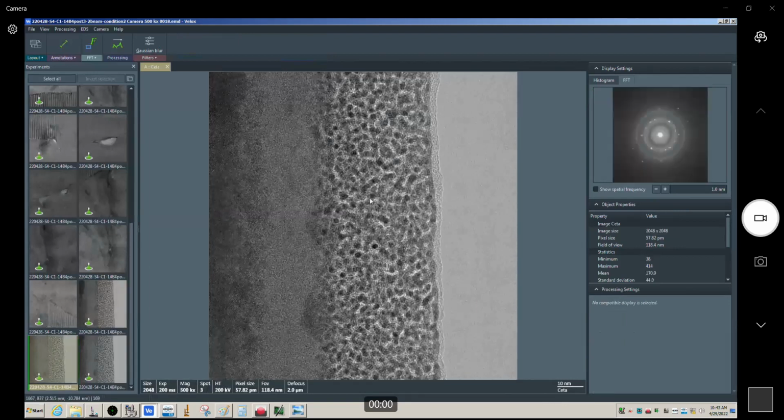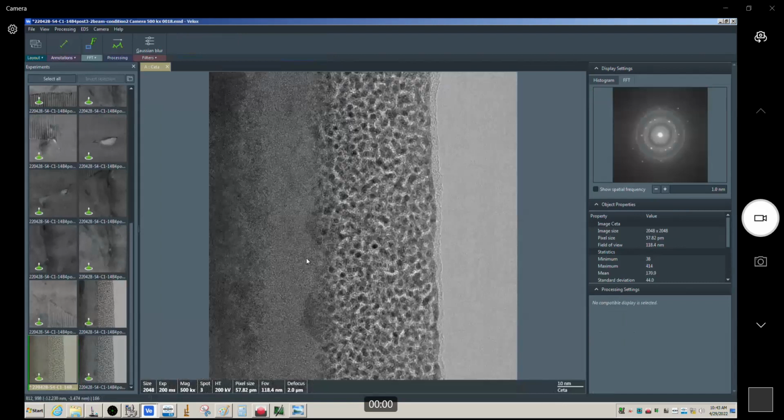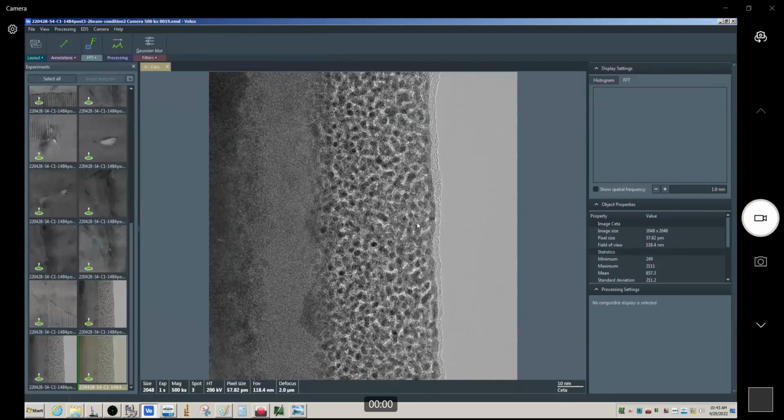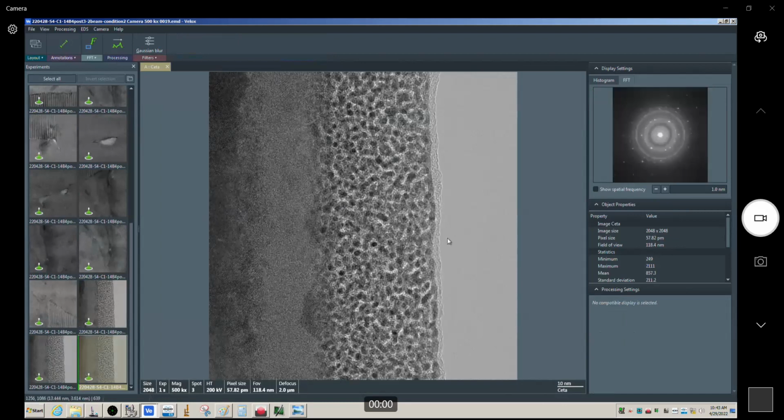This is a second. It's a little bit subtle here, but I can actually see, because obviously I'm looking at it, the signal to noise is much better in the 1 second versus the 0.2 second. You can actually see the exposure time here in the toolbar. So your signal to noise is way better when you go higher in time. The downside of that, of course, is your images get a little more susceptible to drift.